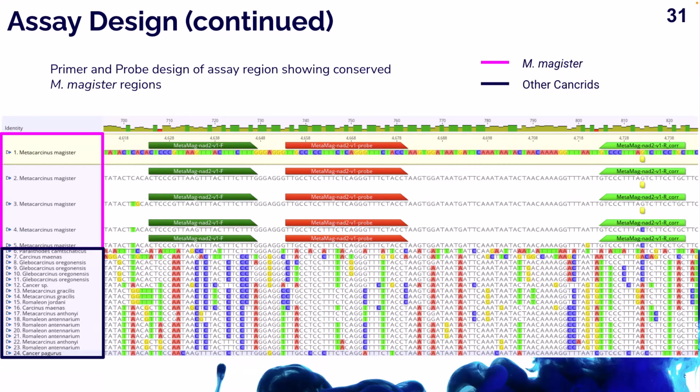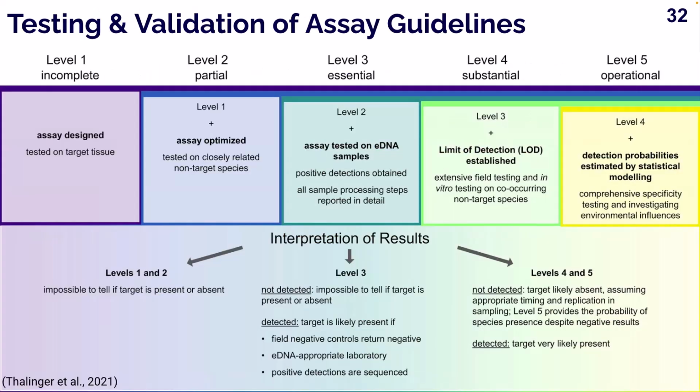And so for this assay, we wanted to specifically show our approach: can we get this assay to not only give us absence and presence, but also quantification as well? So using Thallinger et al. 2021, we used their guidelines that they established to test and validate this assay.